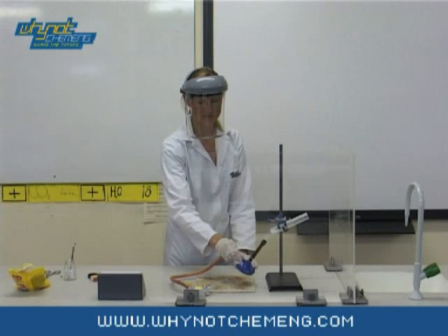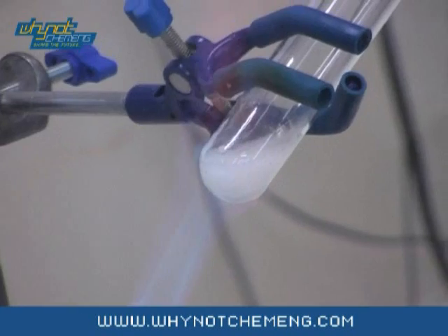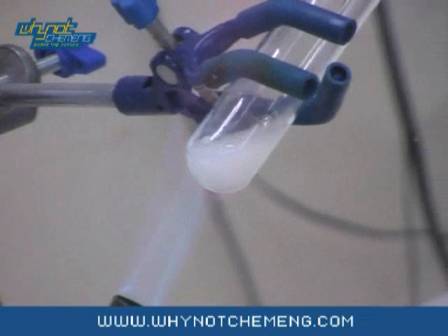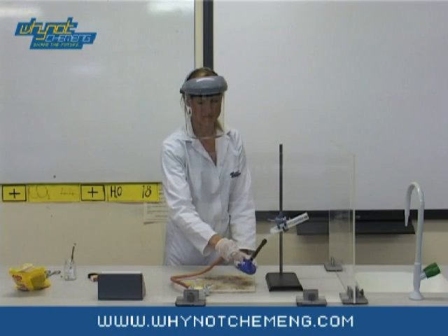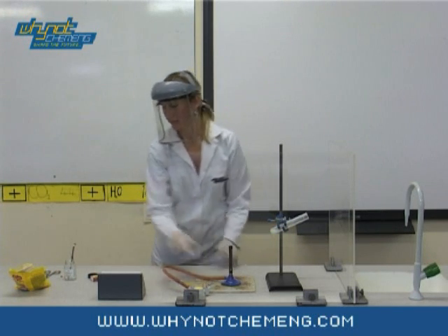The reaction you will see is the oxidation of the sugar in the Jelly Baby by potassium chlorate, a powerful oxidising agent. Do not attempt to use sugar instead of the Jelly Baby, as this may cause an explosion. You will need to ensure that the potassium chlorate is completely molten for this experiment, and it may take some time.